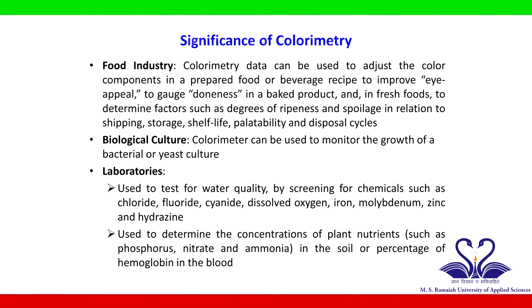Laboratories: used to test for water quality by screening for chemicals such as chloride, fluoride, cyanide, dissolved oxygen, iron, molybdenum, zinc and hydrazine. Used to determine the concentrations of plant nutrients such as phosphorus, nitrate and ammonia in the soil, or the percentage of hemoglobin in the blood.